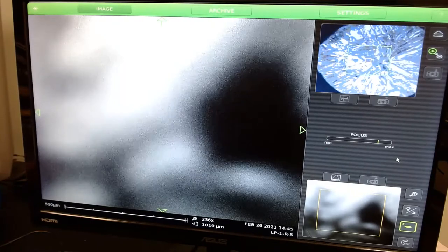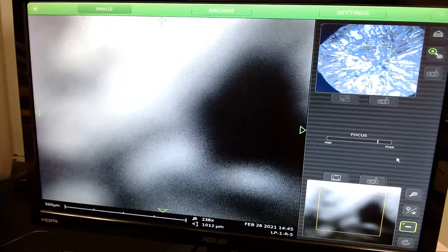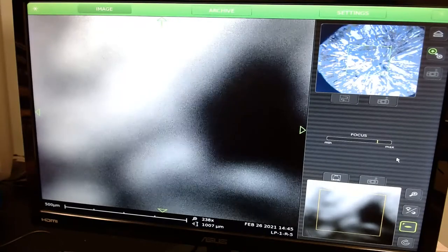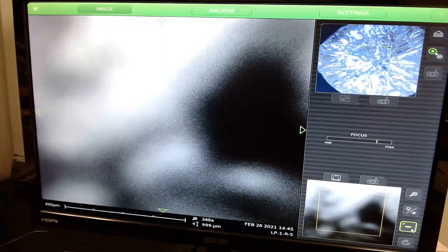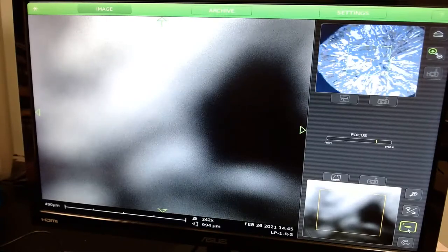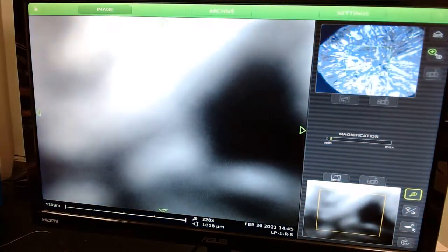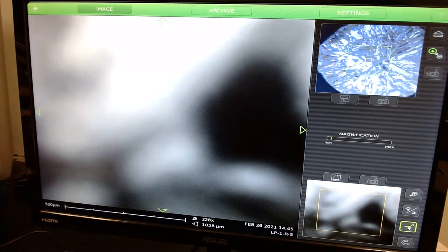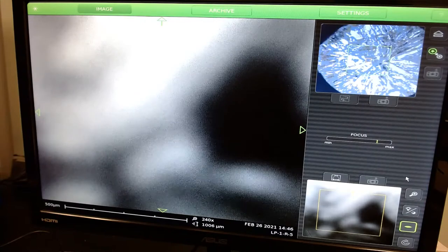Do you remember what sample this is? I don't know what type of metal it is. Okay. It's a very pretty metal when you look at it macroscopically. Yeah, this is just a rod of zinc. Multi-crystalline zinc. The problem with this particular sample is it's got such a big variation in height that you might have to move to find somewhere. I gotcha.